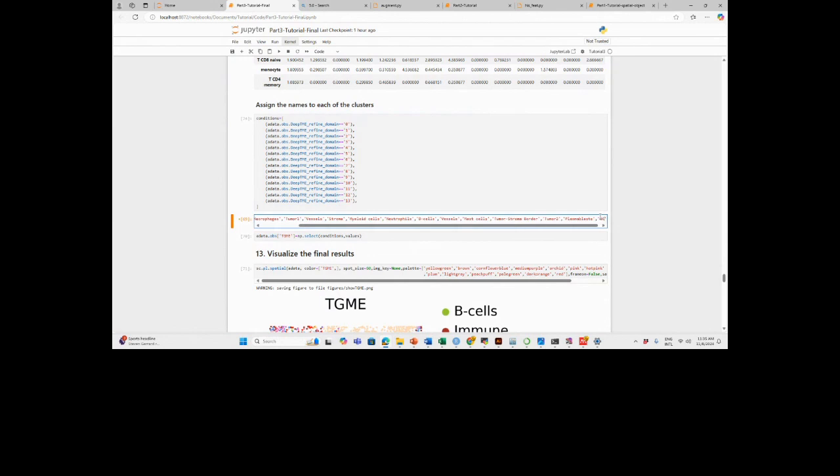It depends on how specific you want it to be. For example, instead of putting natural killer or plasmablast, you can go with lymphoid cells or just call them all immune cells. It depends on how much detail you want to have in your microenvironment. The main idea is that we can identify different tumor regions and the border.